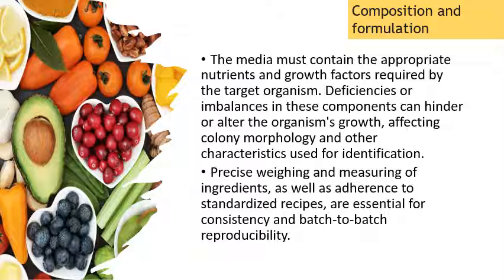There will be a false result leading to unwanted organisms that are versatile in the environment or probably come as a means of contamination, which may now grow, and this will lead to a false result. And every microbiologist's desire is to grow the target organism in every experiment and avoid contamination. So the formulation is essential. The composition and formulation must be adhered to strictly.